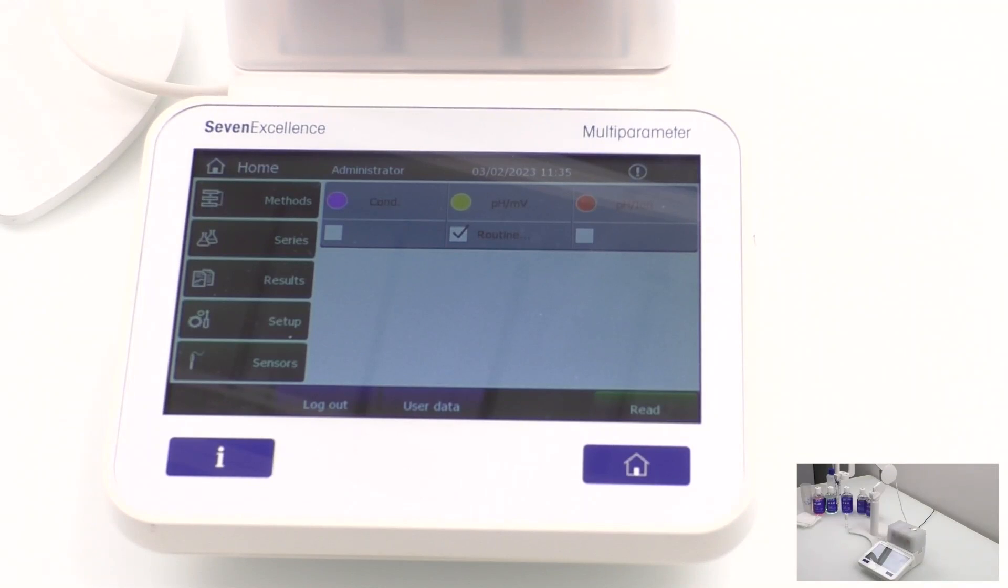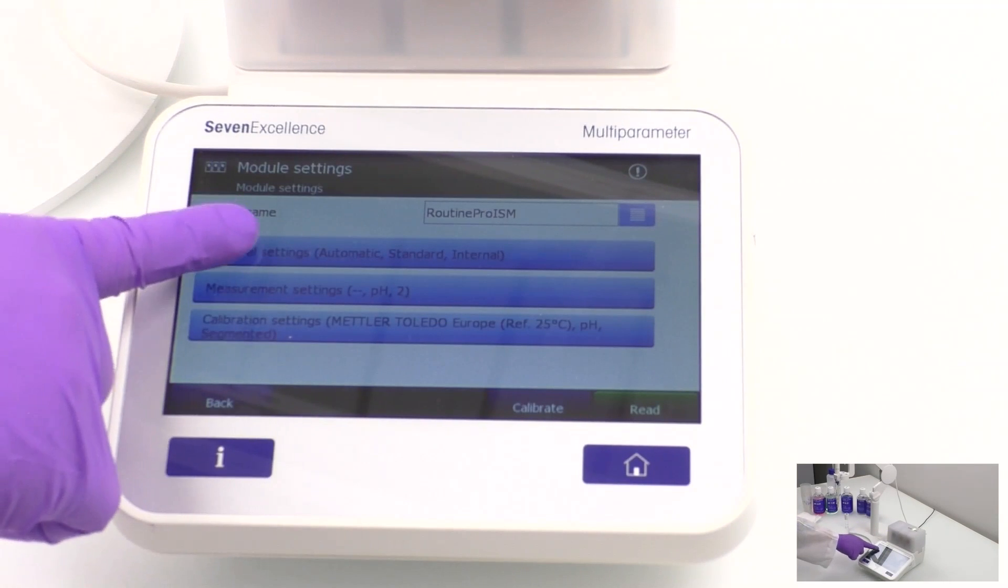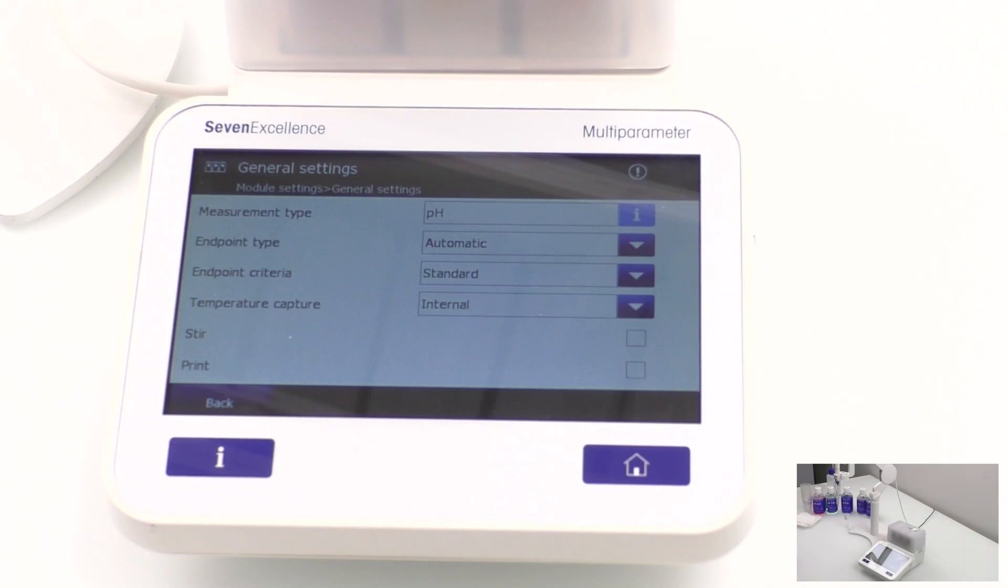To set the meter ready for the standard buffers, click on the pH module and select General Settings. Keep the endpoint type as Automatic and the endpoint criteria as Standard. Also, keep the temperature capture default Internal, as the sensor already contains the temperature probe. Once you're finished, click back.